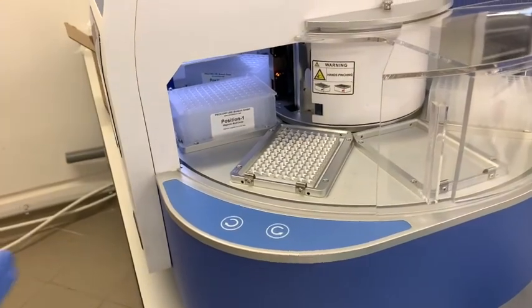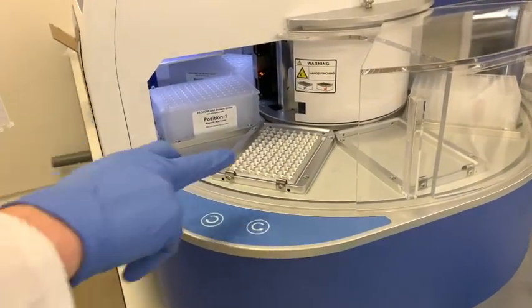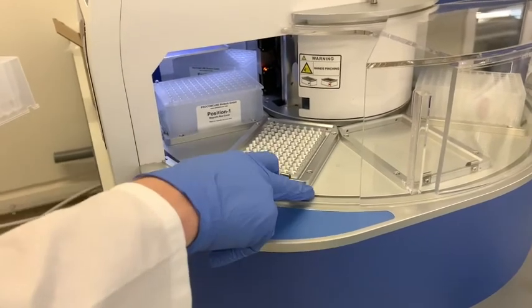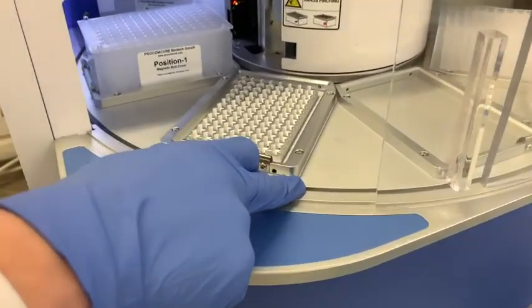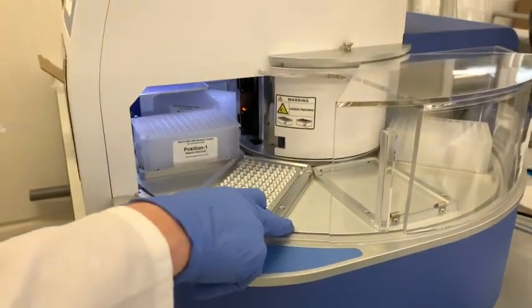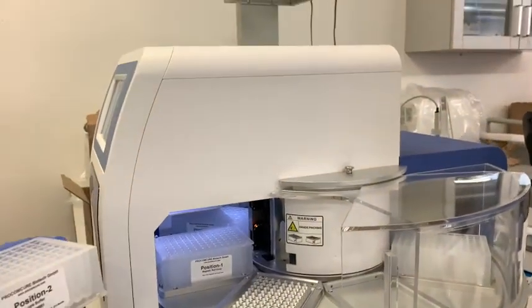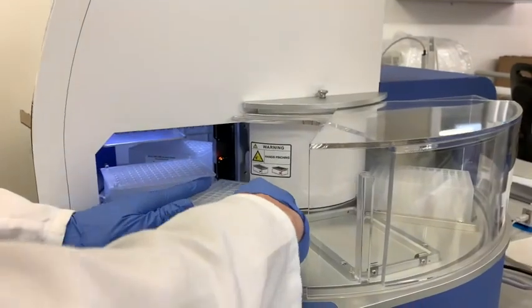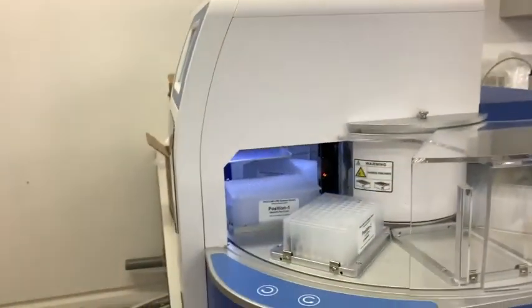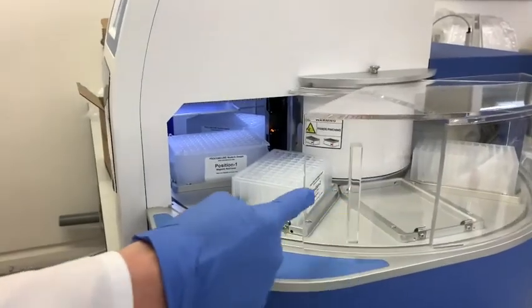After completing the pipetting, bring the lysis buffer — which is position 2 — and place it in the extractor machine. Please note that position 2 differs from position 8 in that position 2 has the option for heat, in cases when you need to use blood and it requires enzymatic digestion at 140 Fahrenheit, or when using the option to increase DNA elution efficiency. This can be set up manually.